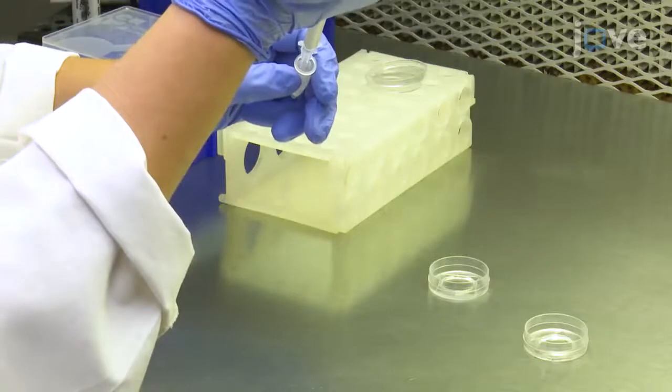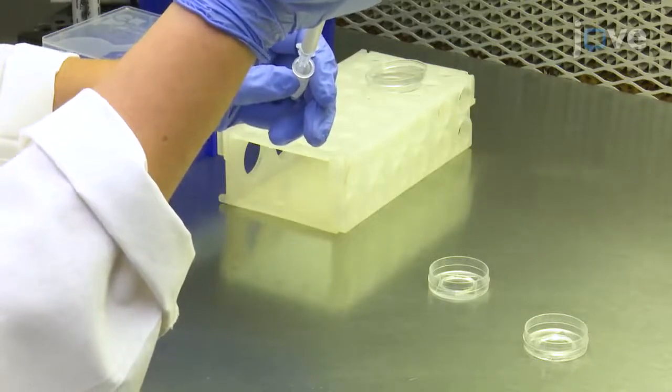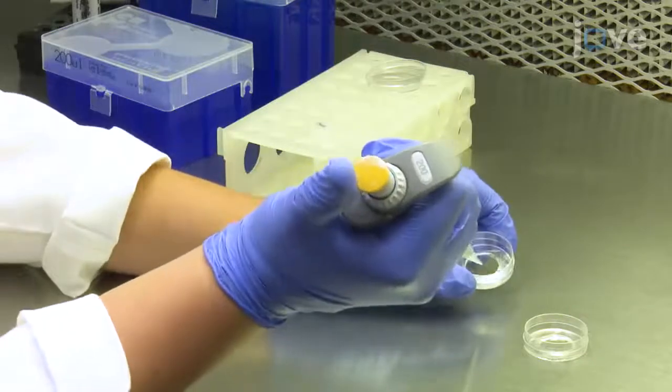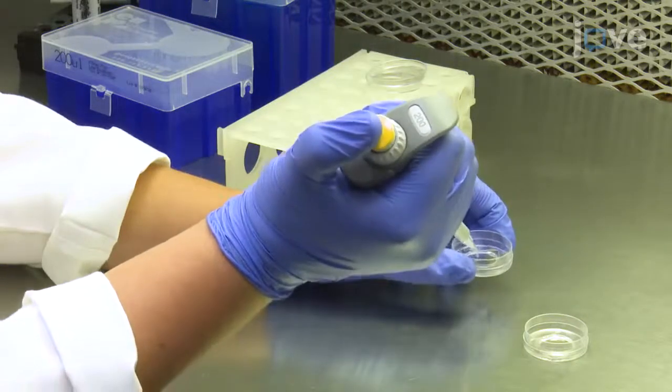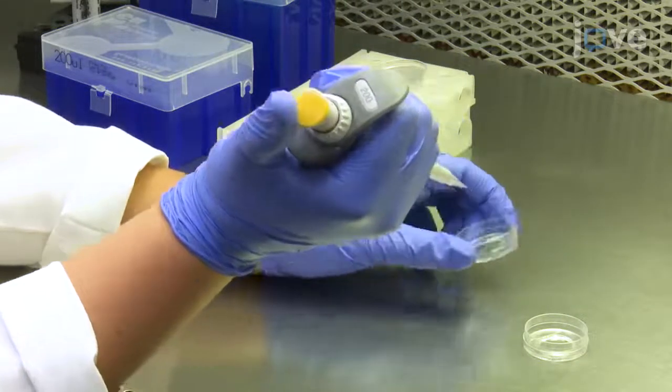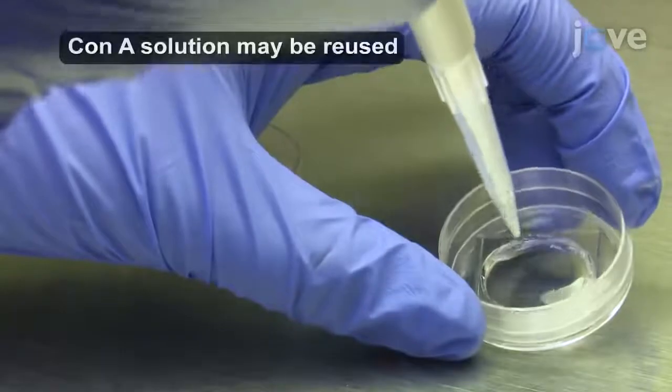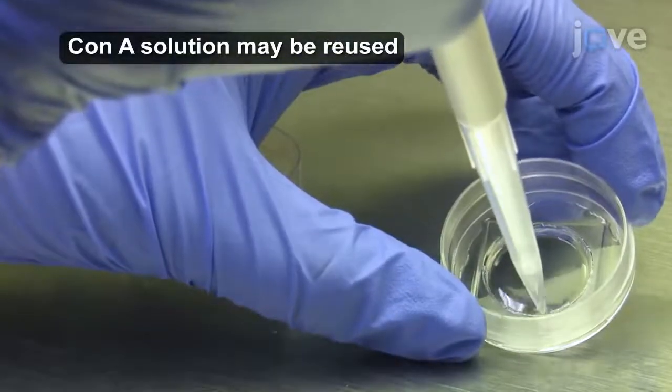To begin, coat the glass portion of 35-millimeter glass-bottom dishes with 200 microliters of Con A solution. Incubate the dishes for approximately 2 minutes at room temperature in a tissue culture hood. After this, remove the Con A solution and allow the dishes to air dry completely.